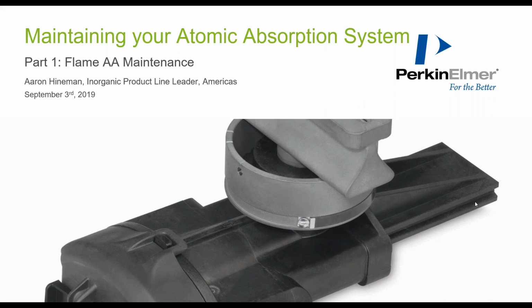Both Aaron and Sarah are the PerkinElmer experts on atomic spectroscopy, and they've put together a comprehensive presentation today that will take you through flame maintenance, both PerkinElmer AA systems, troubleshooting, and maintenance.